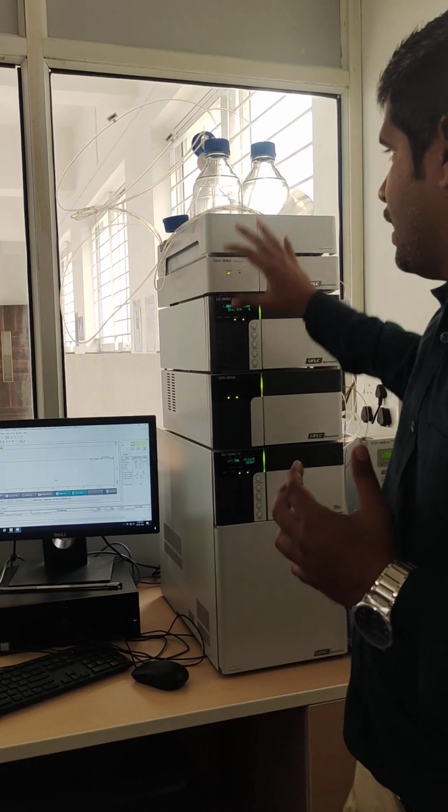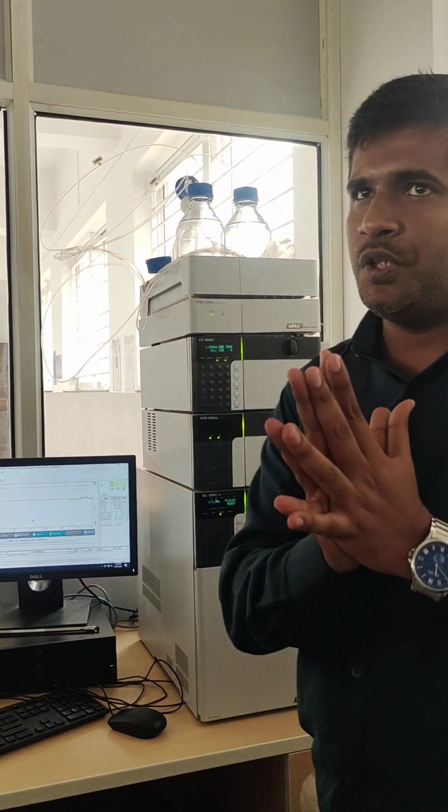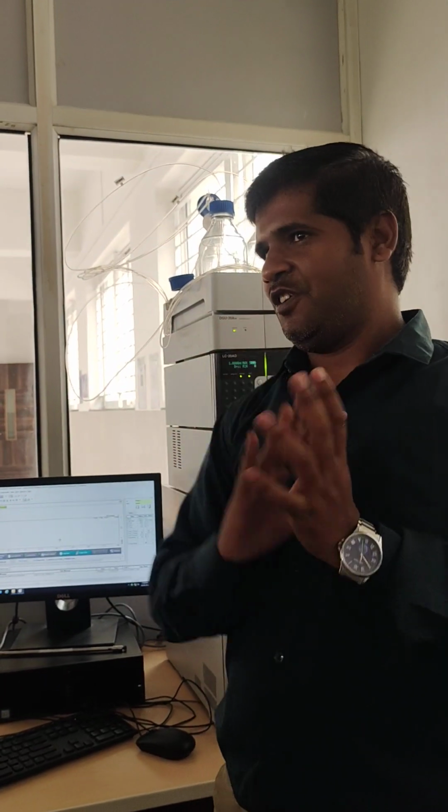After addition, I will not perform the analysis directly. Before that, I will purge the system. What will I do? Purge. Purging I will do. Purging means, yes, blank check. And purging is necessary for what? Purging means flowing of the mobile phase at the highest flow rate. That is called purging, isn't it?